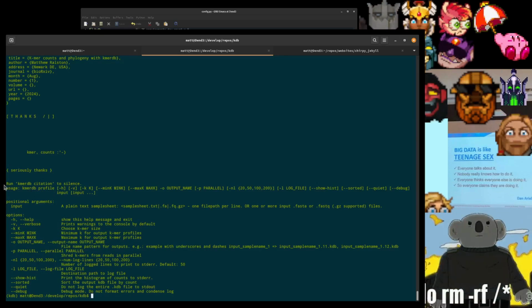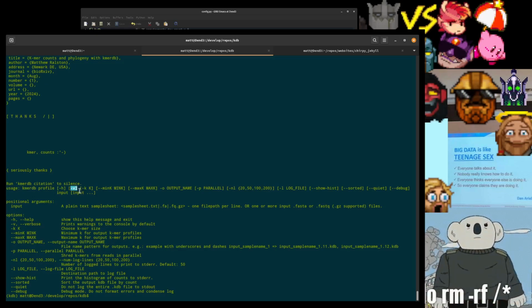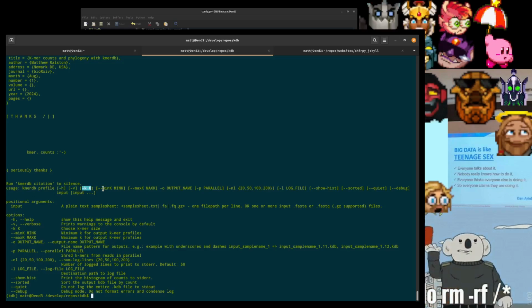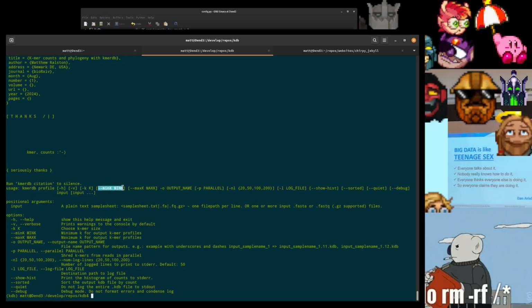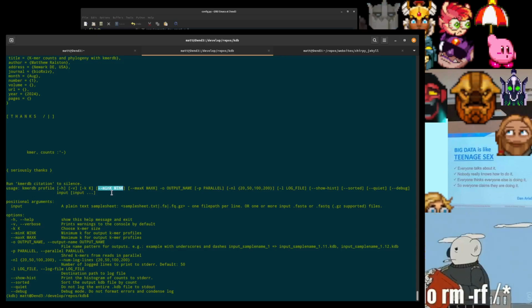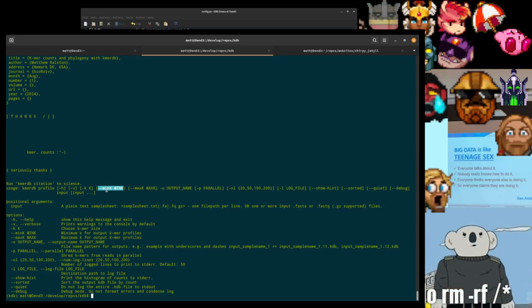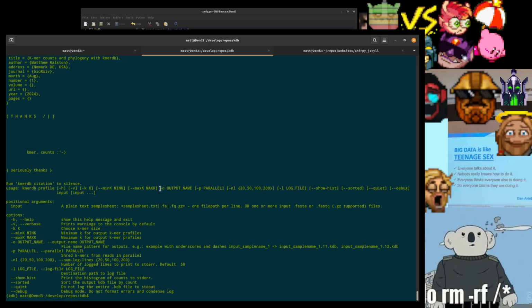This is the usage statement. You can use verbosity flags, and a choice of k that is required. You can also alternatively choose a min k and max k, and it will run the program across all choices of k that are between min k and max k.